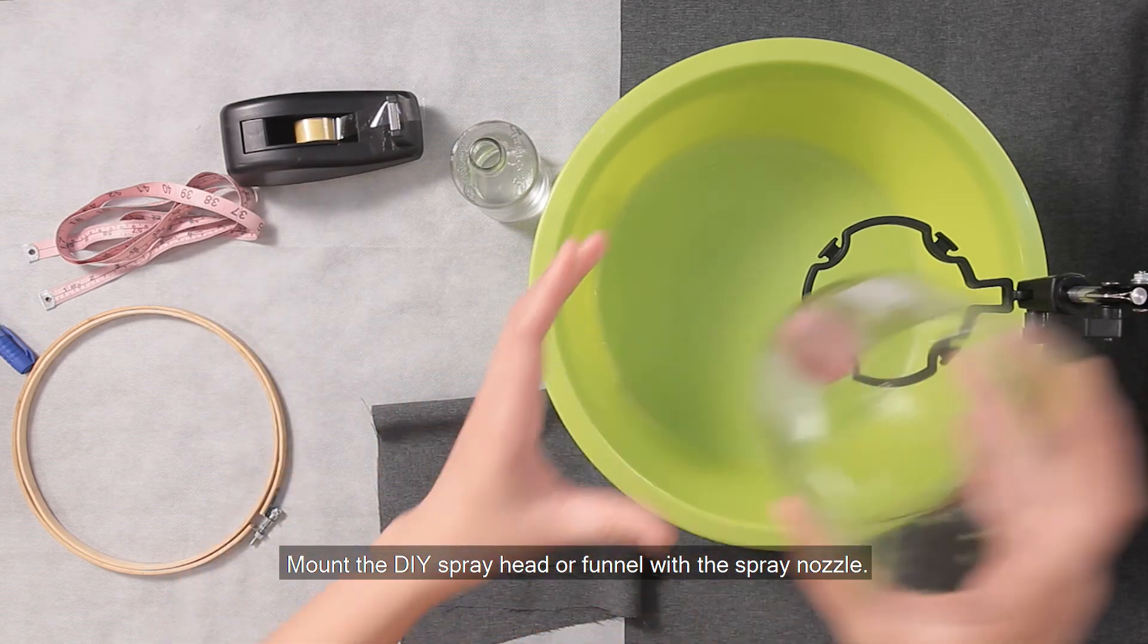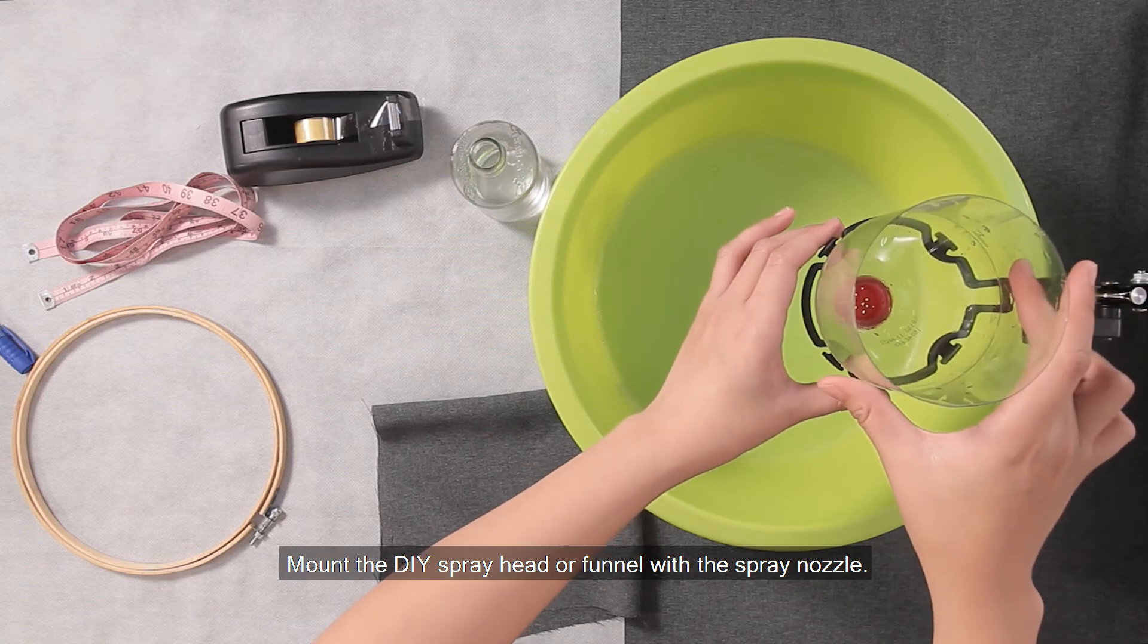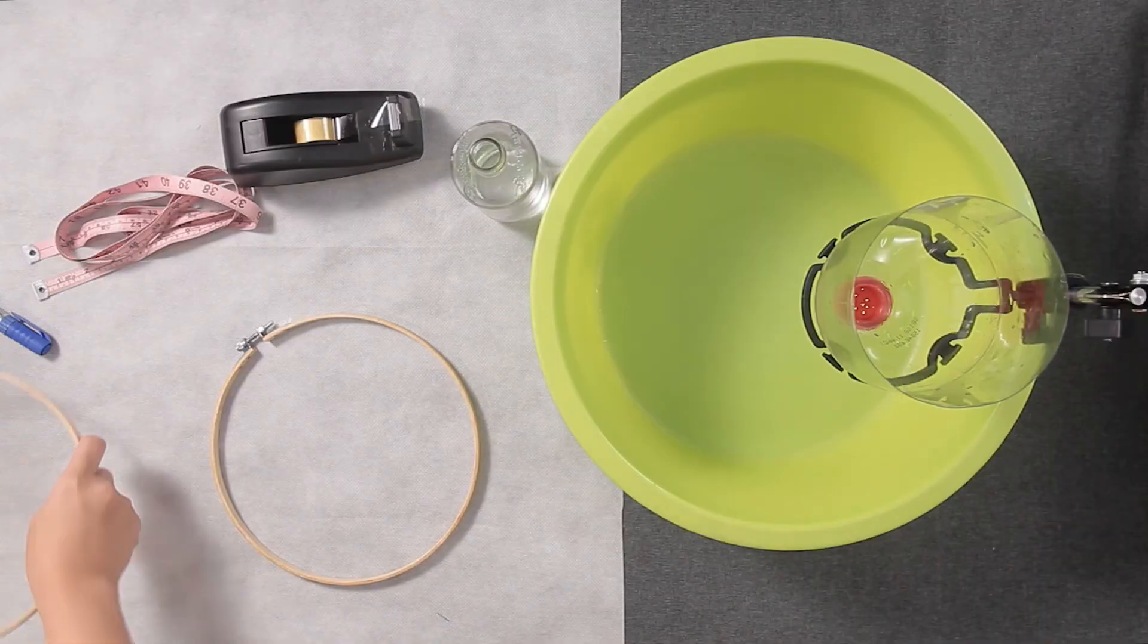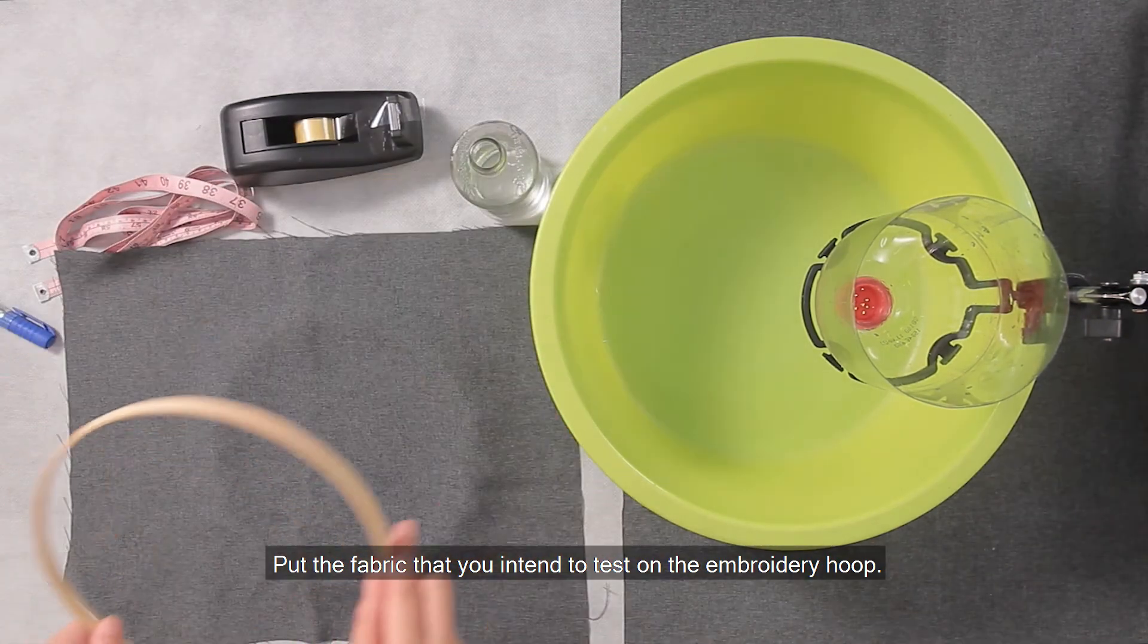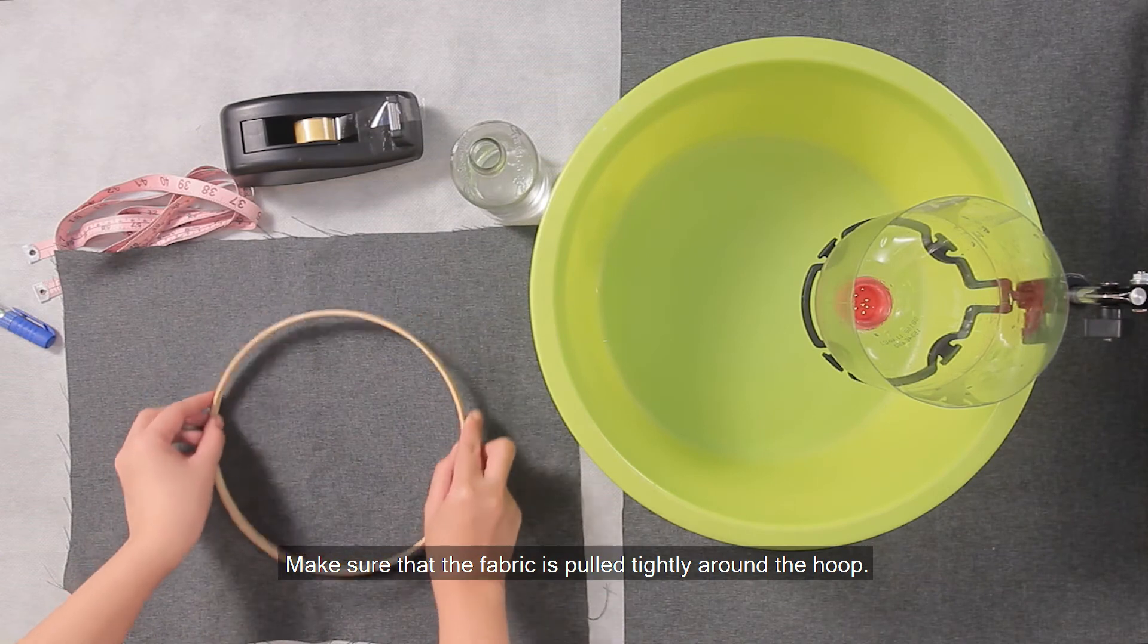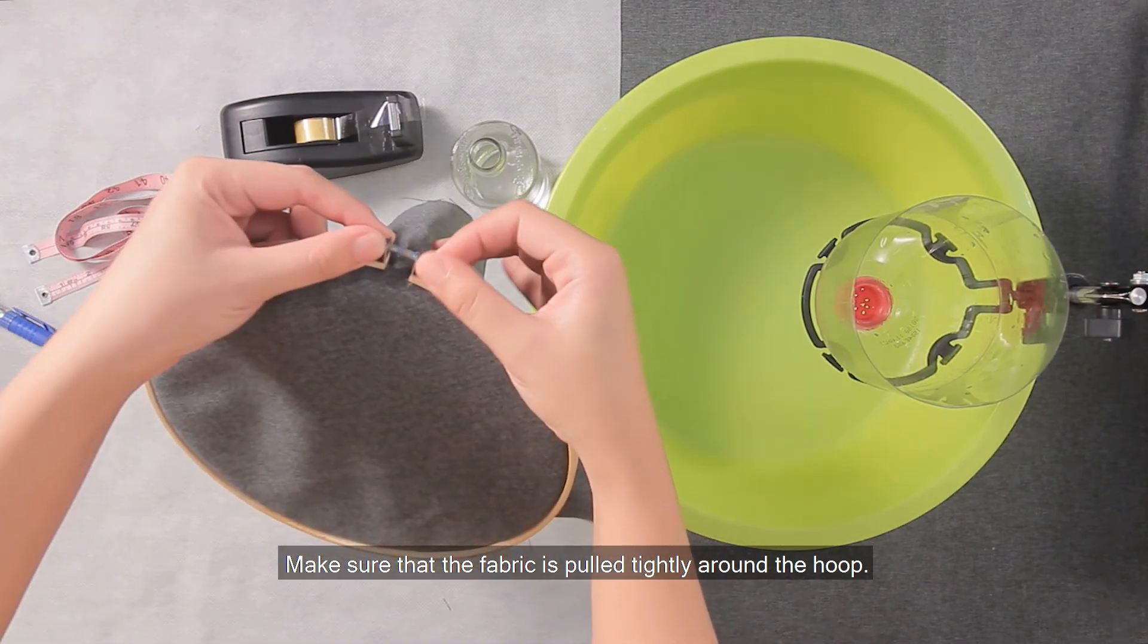Mount the DIY spray head or funnel with the spray nozzle. Put the fabric that you intend to test on the embroidery hoop. Make sure that the fabric is pulled tightly around the hoop.